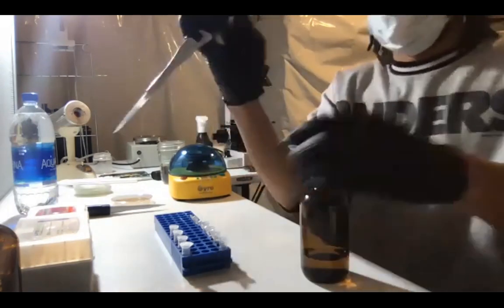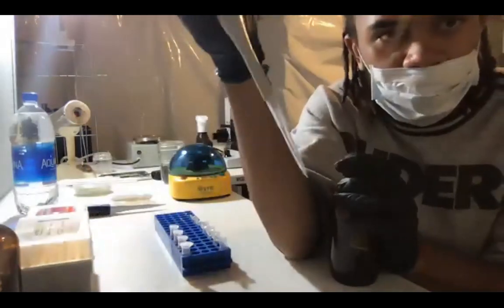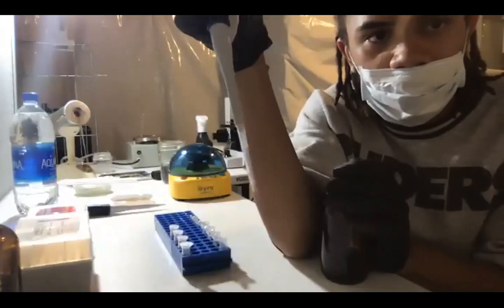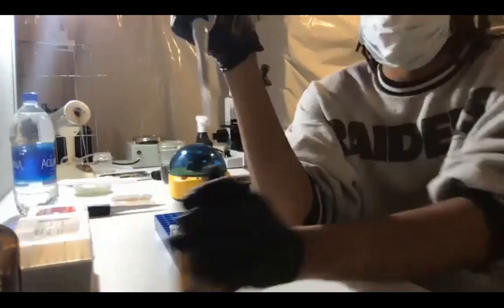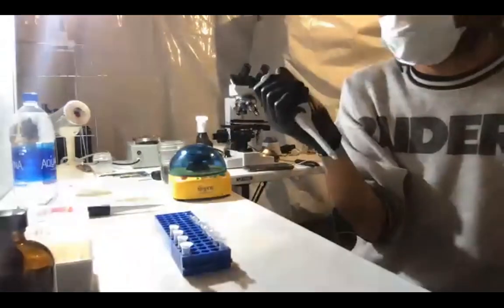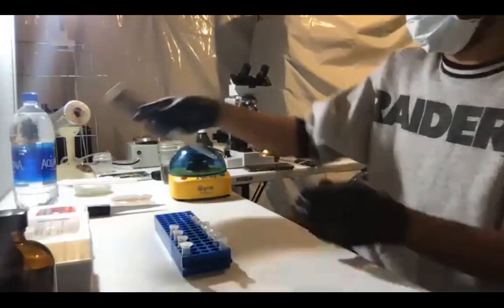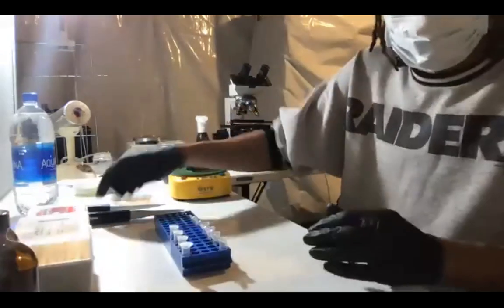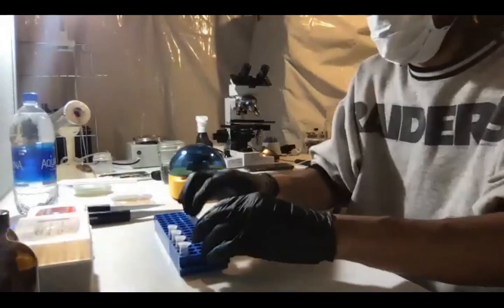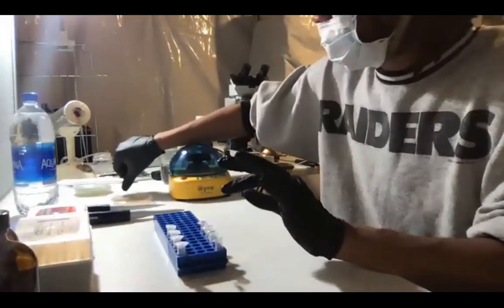And on the end of the pipette, there's another button right there. And if you press it, it'll eject the tip off. So you can see, I'll just do this for your demonstration right here. You see the tip just popped right off. I usually have my trash can next to me so I can just pop the tips off over there. Some people keep a little lab trash thing on their table so they can pop the tips off in there. So I'm gonna close all of these except for the first one.